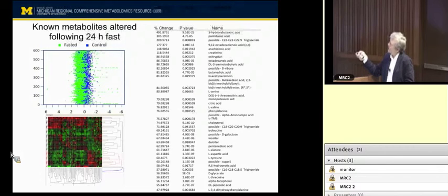There's red here, and then in this group you've got a bunch of green. And you go back and take a look at what's the difference of these fed animals versus the other fed animals, and it's that all these animals were in one cage. But they were all sitting in the same room, getting the same food, and the blood was harvested at the same time and processed the same day and run through the machine and analyzed the same way, yet they're different.